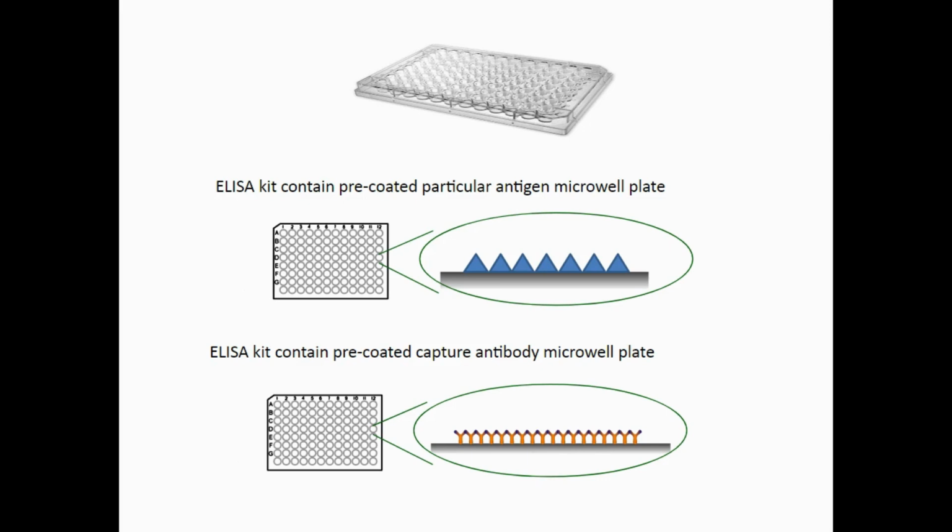So the types of ELISA. There are basically 4 types of ELISA: direct, indirect, sandwich ELISA, and competitive ELISA. Before discussing them separately, let me first clear the concepts of primary and secondary antibody, so it will be easier for you to understand these types of ELISA. The primary antibody is the antibody which is antigen specific, meaning it is produced in response to a particular antigen.